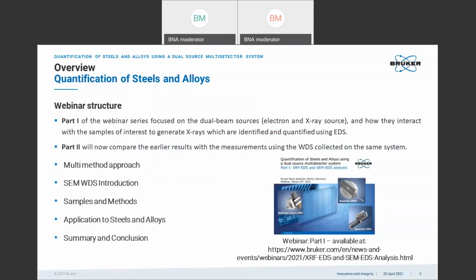So this is part 2 of a presentation on the quantification of steels and alloys. We'll be focusing on the WDS component and what it brings to the ability to quantify various elements. As an introduction and overview, the first part of this webinar was presented approximately a month or so ago and is available through the Bruker website.